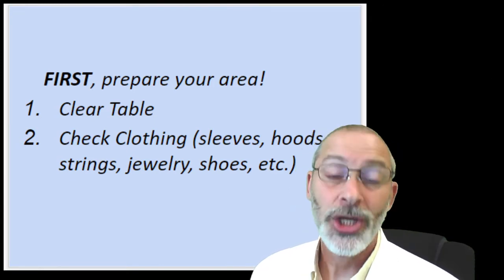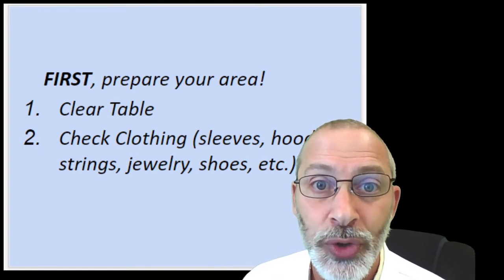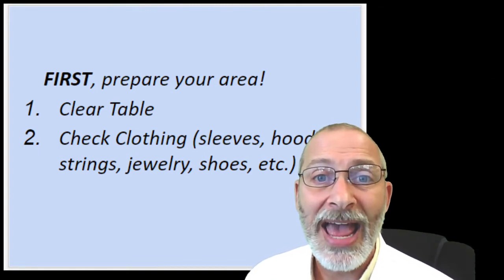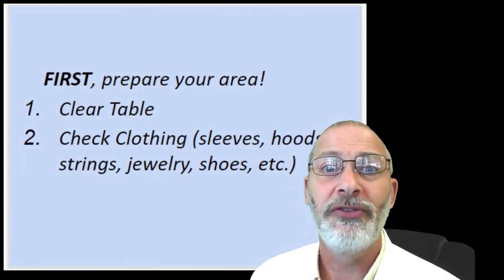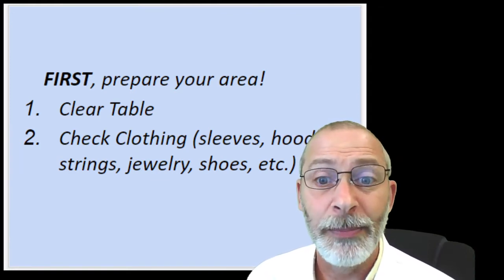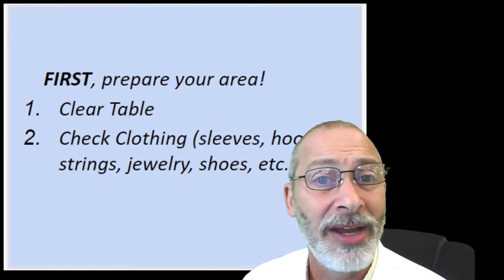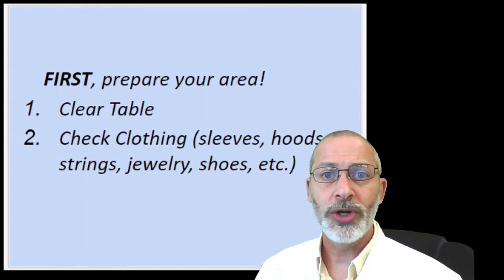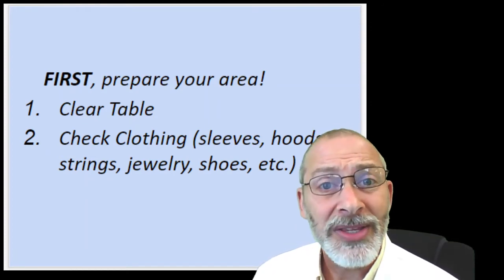Shoes. You can't wear sandals in the laboratory. In fact, in my laboratory, you cannot have any exposed flesh below the table. So I'll just mention pants here as well. You have to wear pants, no shorts. No shorts are permitted in the laboratory when we're working with chemicals or Bunsen burners.